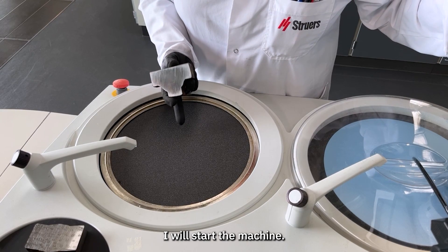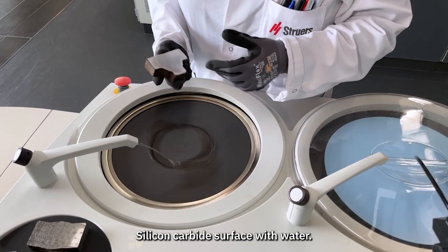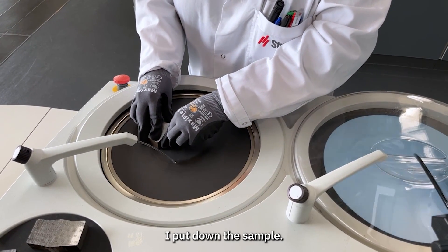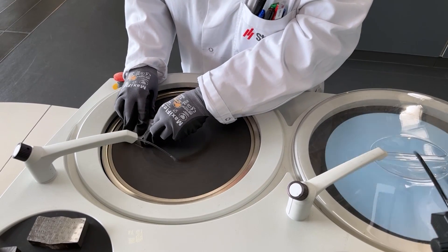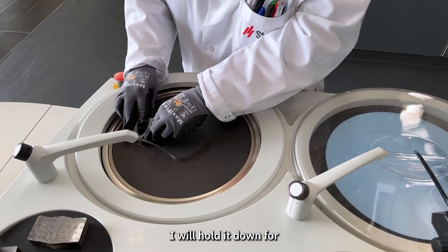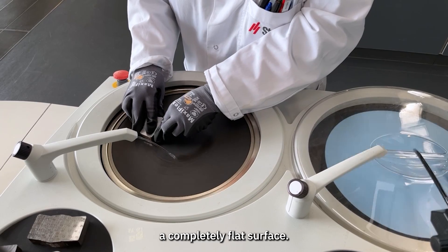I will start the machine. This is a relatively rough silicon carbide surface with water. I put down the sample and will hold it down for half to one minute, depending on whether you get a completely flat surface.